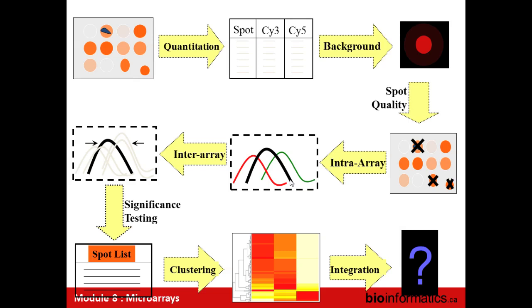Yeah, so if we have a feature, that feature contains millions of individual strands, but there are, for any gene, typically 1 to 10 features representing that gene.